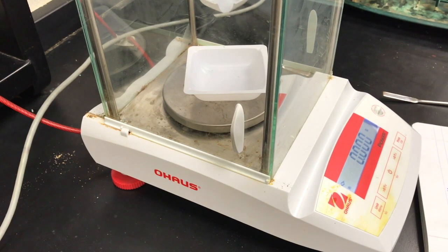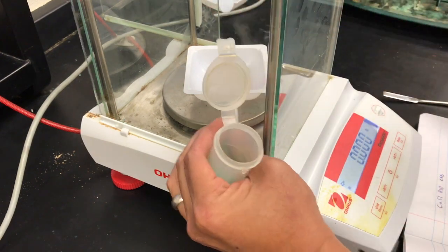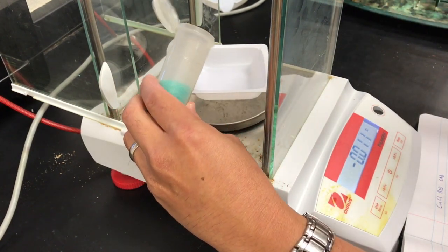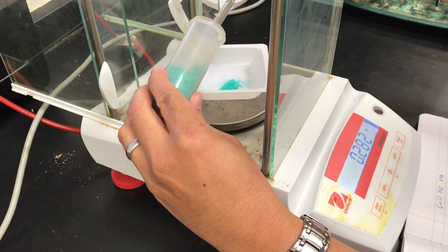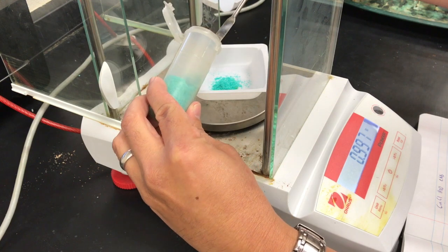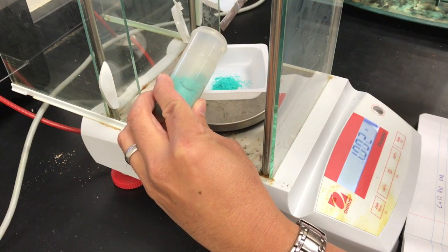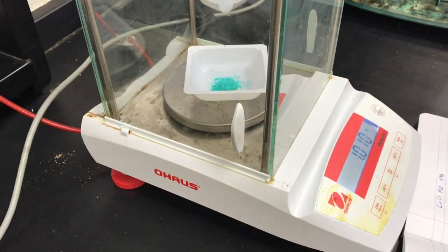Next, we're going to weigh out about 1 gram of our copper chloride hydrate sample. So I've tared the balance already with a weighing boat, and I'm going to scoop and get around 1 gram. If I don't get exactly a gram, that's okay. This is all relative to the mass that you're starting with. Alright, we're going to record the sample mass as 1.011 grams.